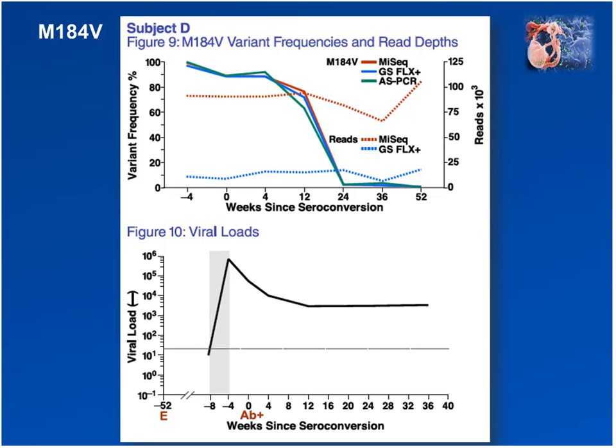So let me familiarize you with these plots. You're going to be seeing 4 of them. Let me just go through them quickly, or let me go through this particular one so that you get an idea of what you're seeing on the remaining ones as well. The data we'll be reviewing is for a few individuals from PrEP studies who were identified very early as HIV positive. Study drug was then stopped in these individuals as per study protocol. They were then tracked longitudinally after stopping study drug.